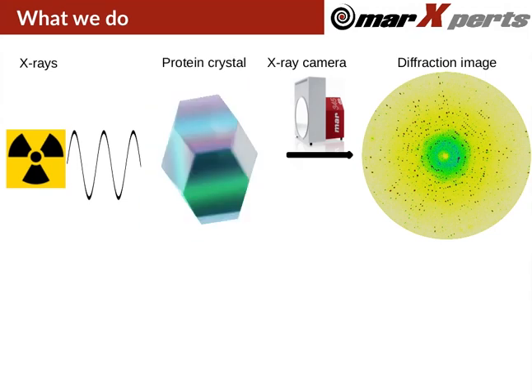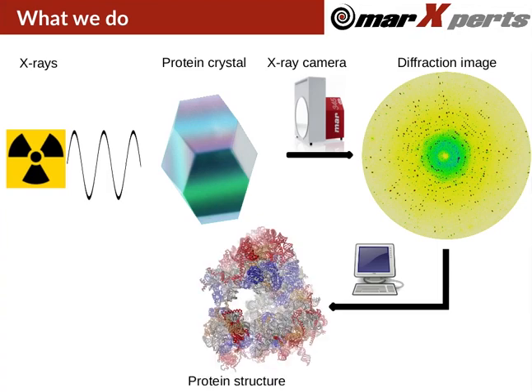In fact, most of our instruments are used to look at protein crystals. There are about 20,000 proteins in a human body that carry out the work for life functions. With powerful computers and sophisticated programs, it is possible to determine a three-dimensional structure of a protein from a series of diffraction images. The three-dimensional structure actually reveals the position of single atoms of the molecule, something a conventional light microscope would never see.